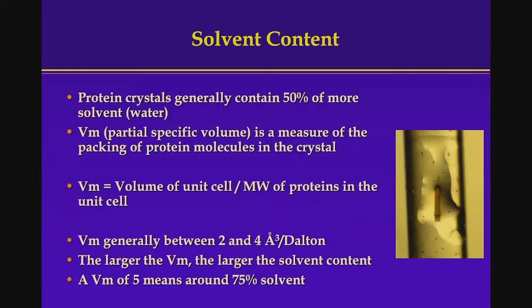So way back then, what we did is we put the crystal in the capillary, you see right here, and then we seal both ends using wax. That way we leave some water around the crystal and maintain the water vapor pressure so it doesn't dehydrate. Okay.